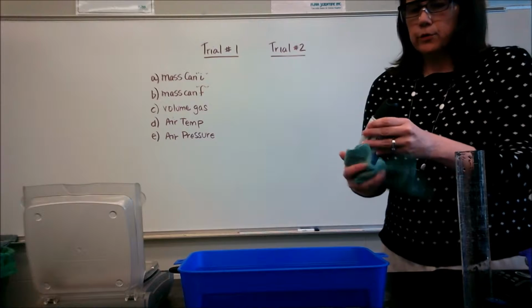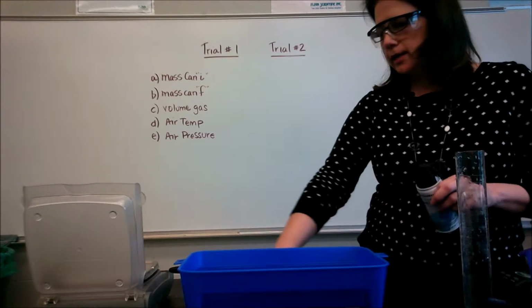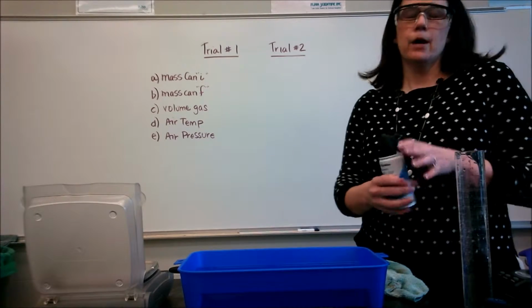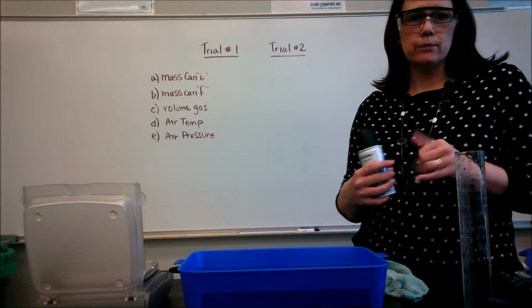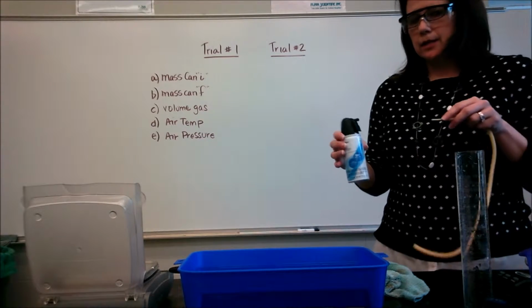So we've already done the Avogadro's principle lab, where we collected gas just from the regular gas jet in the chemistry room. And we determined that no matter what the gas, if you know the volume, the temperature, and the pressure, the moles will be equal. So we're doing another application of the ideal gas law today.